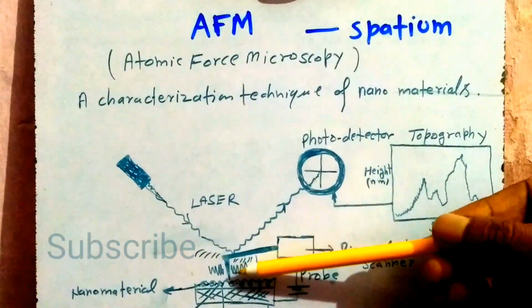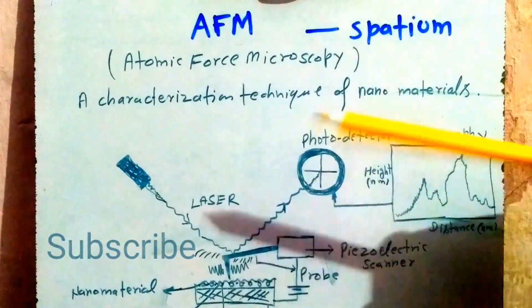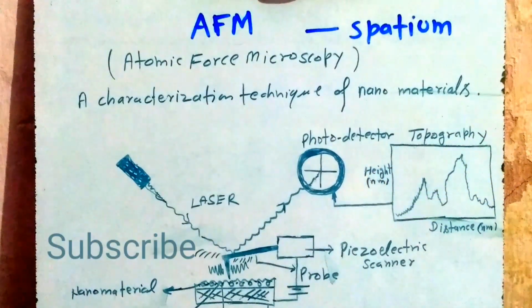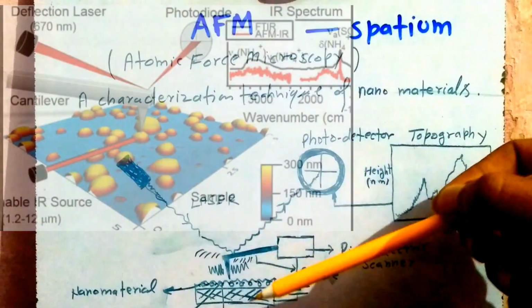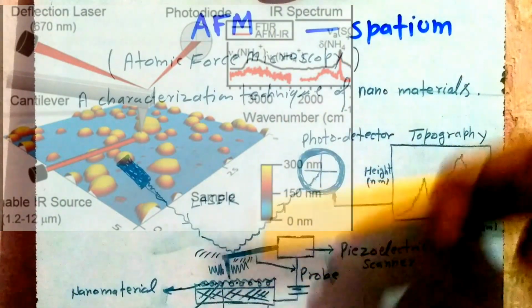When the probe is near the surface, the Coulombic force repels it, and when there is a gap between two atoms, the probe goes deeper, closer, and when an atom comes, it repels the probe outside.